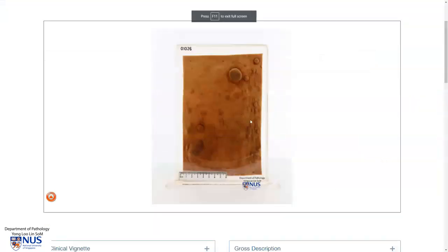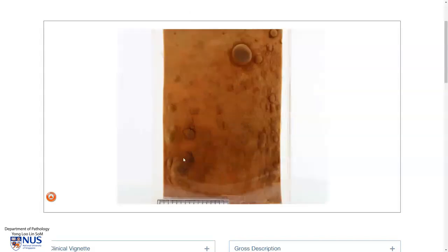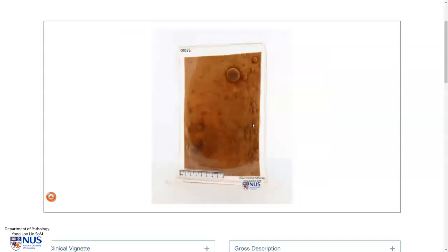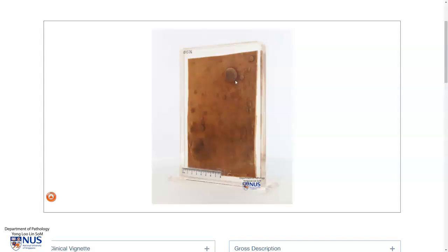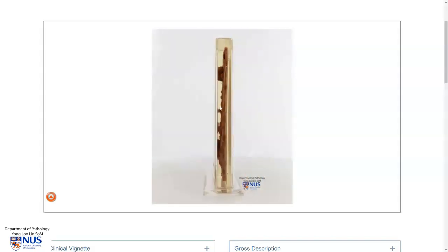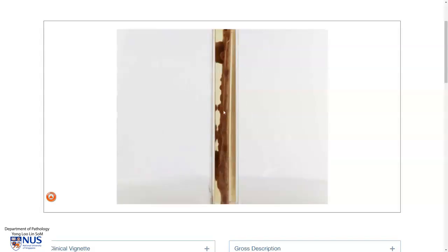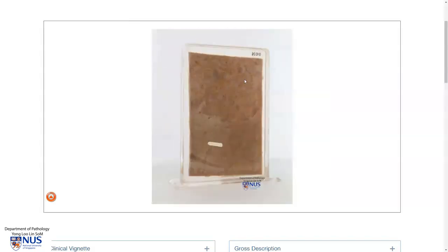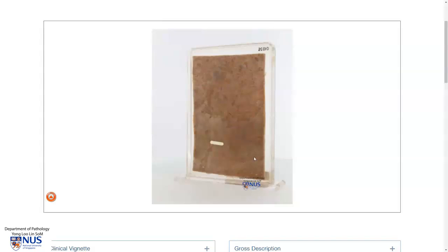This is another example of neurofibromas where we see multiple neurofibromas of different sizes arising in the skin — this is an example of neurofibromatosis. On the side view, we can see that these are actually raised nodules or plaques. This layer here is the epidermis, and this is the dermis and subcutis. These lesions are actually relatively superficial in this particular specimen.